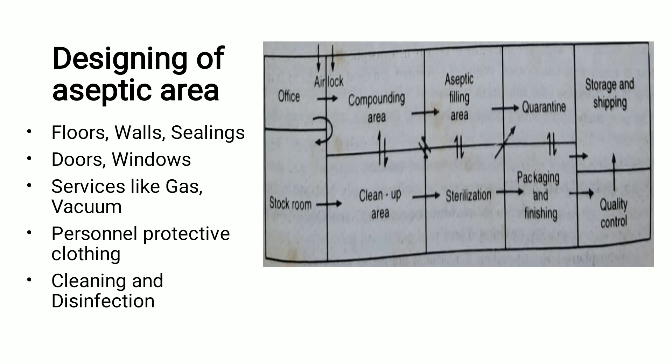Special care must also be taken with services such as gas and vacuum. Any gas pipes or vacuum pipes installed in the aseptic area should be placed mostly underground, or if they run along the wall, they must be fitted properly to ensure no contamination enters through these service lines.